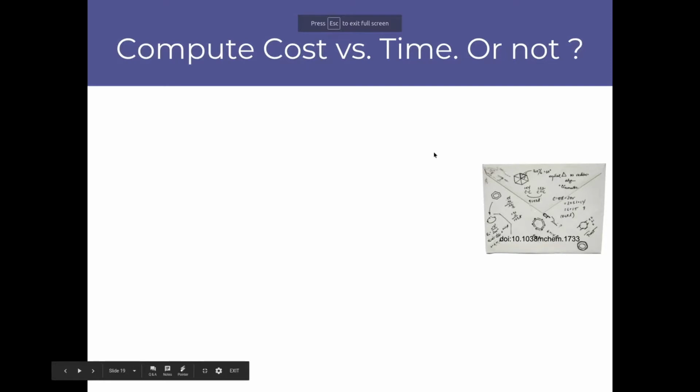I have to assure you, if I had taken the Galaxy tour that I introduced at the very beginning, I wouldn't have pressed the wrong buttons and I wouldn't have lost my way and I wouldn't have to go forth and back between presentation and the live demo.